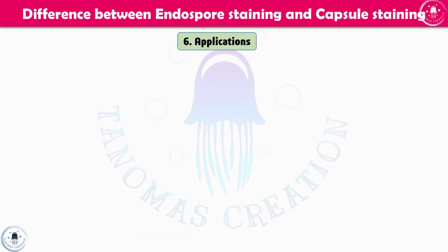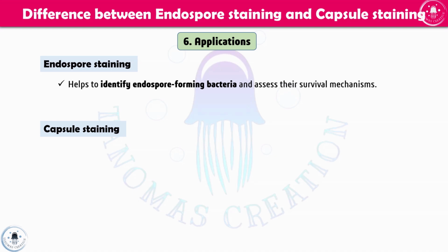Now coming to the applications of endospore staining and capsule staining. First, endospore staining. This helps to identify endospore-forming bacteria and assess their survival mechanisms.